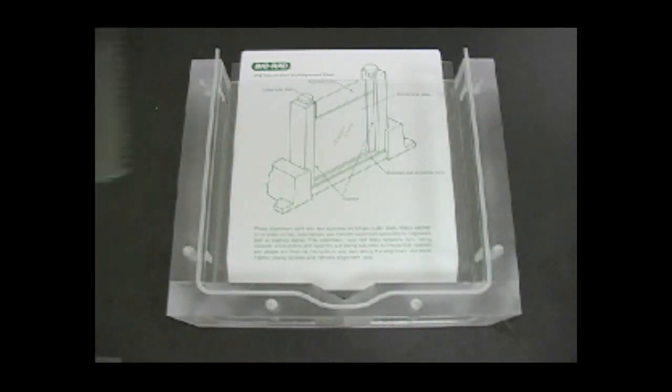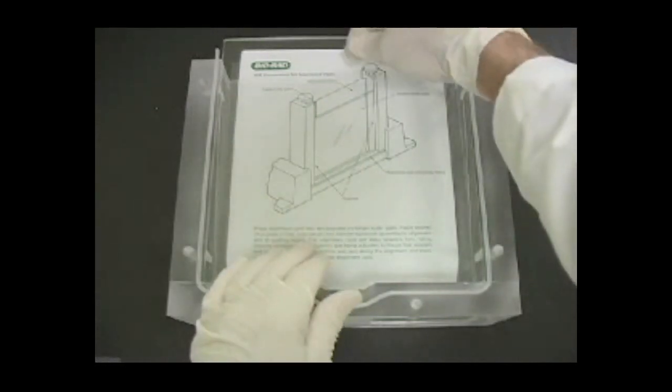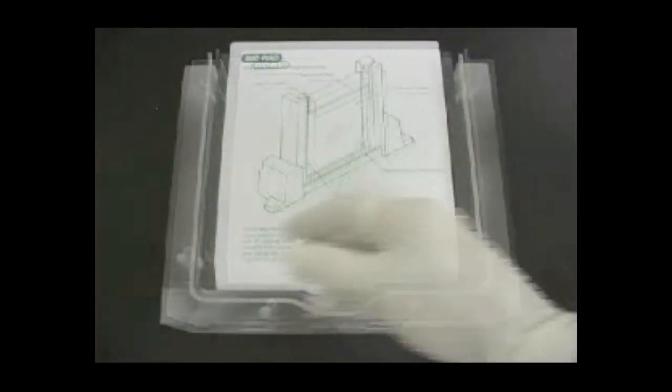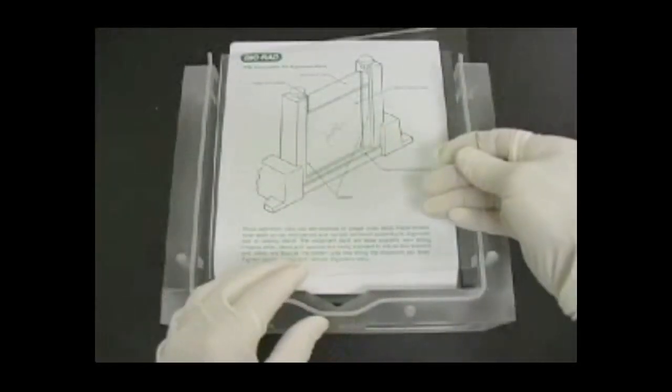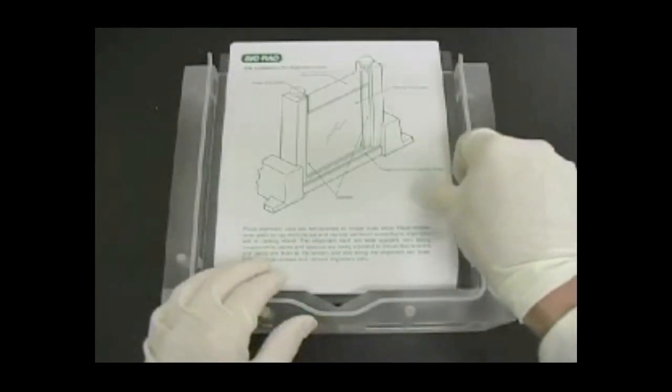Continue to place pieces in the same order: long outer plate, spacers, alignment card, short inner plate, and separation sheet.